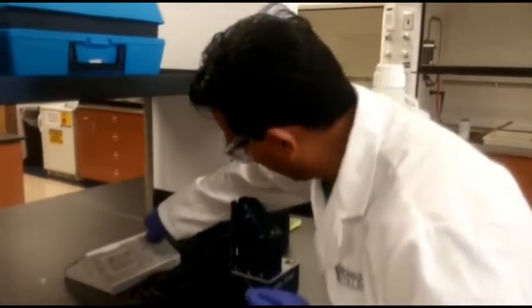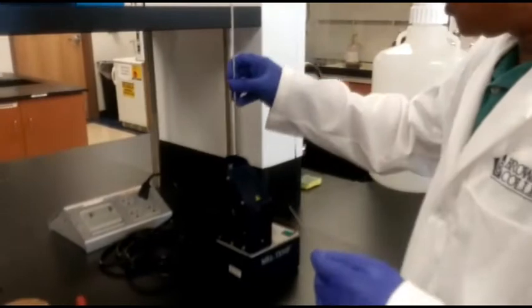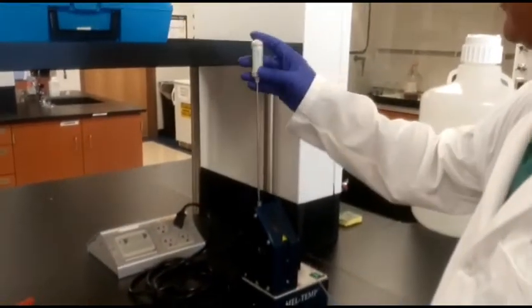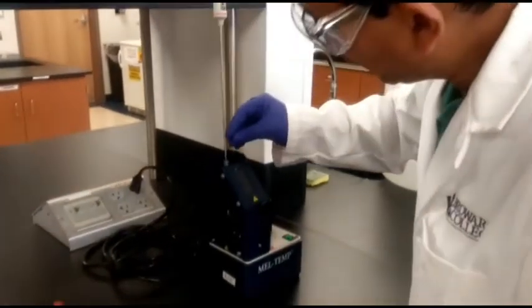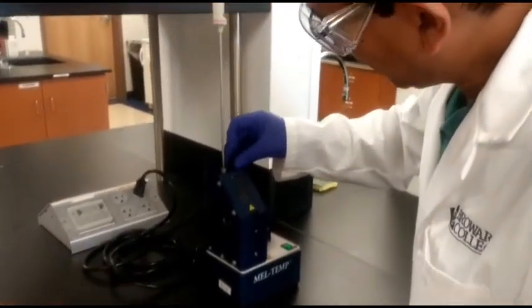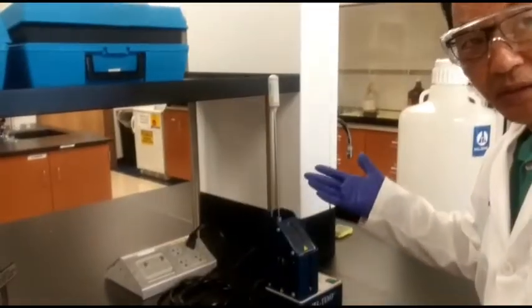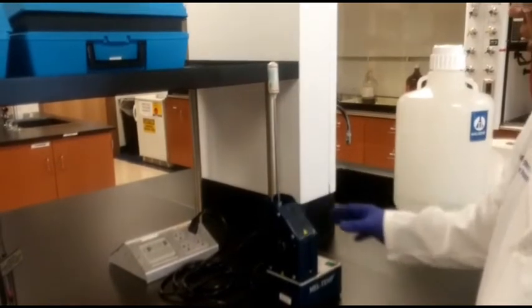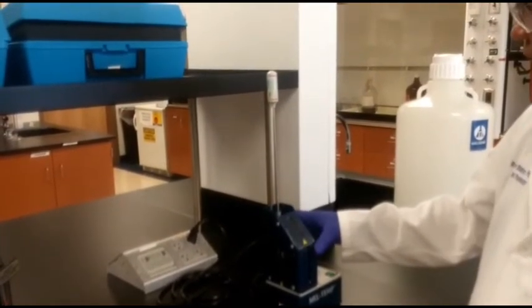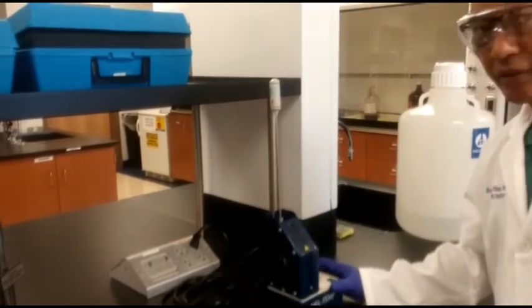I'll just plug it in there and turn it on, and here is the thermometer that is already on, in Celsius, so we put it in the slot, and we will wait for the sample to melt. And now the sample has melted. The melting point is 131 to 132 degrees Celsius. So that is the melting point of the sample.